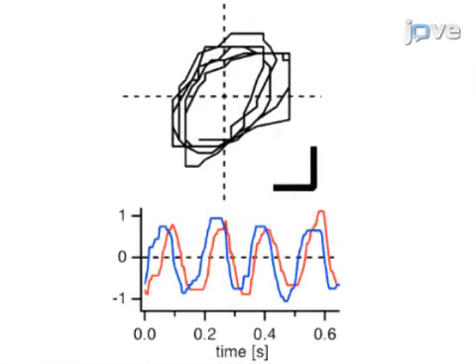Ultimately, the reconstituted tip movements of the cilia are categorized and quantified based on the patterns of their motions. This method can help answer key questions in cell biology, such as how is ciliary motility controlled during development, and how does pattern of motility change over time. The implication of these techniques extend towards pathophysiological analysis and diagnosis of cilia-associated diseases, as our fundamental understandings of kinetic cilia is still sparse.